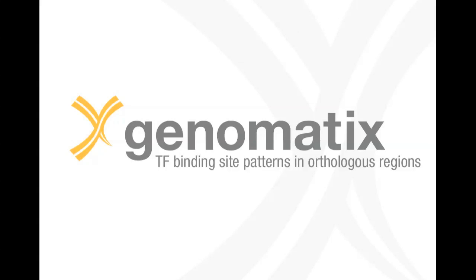In this tutorial you will learn how to retrieve orthologues for a list of genomic regions and run a comparative analysis on them to identify phylogenetically conserved regulatory structures.